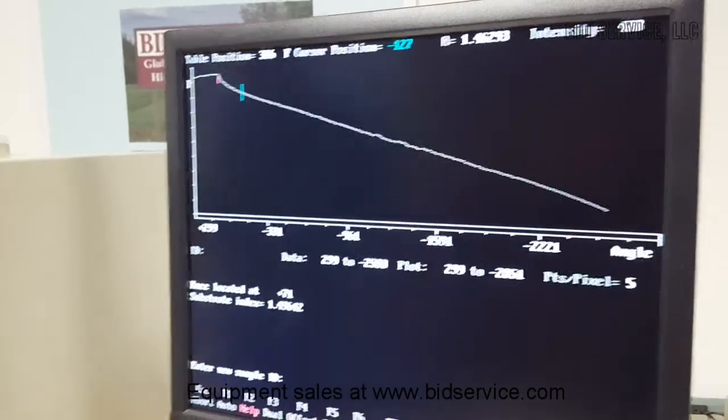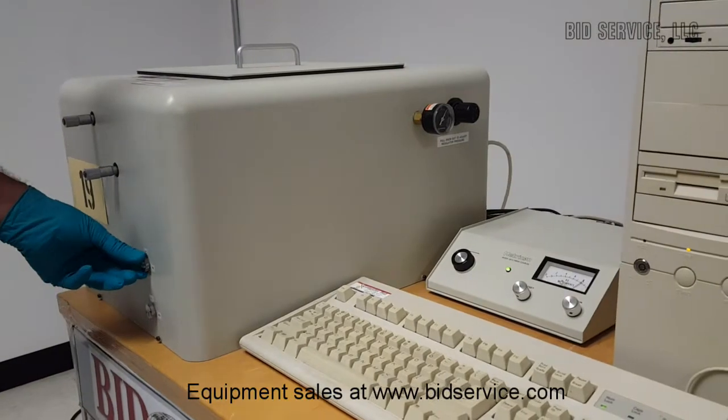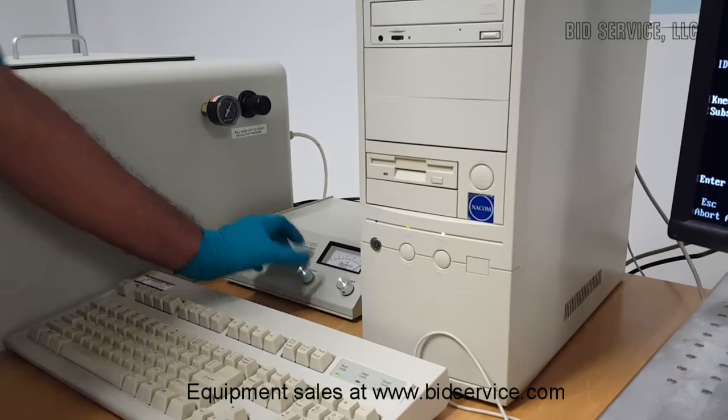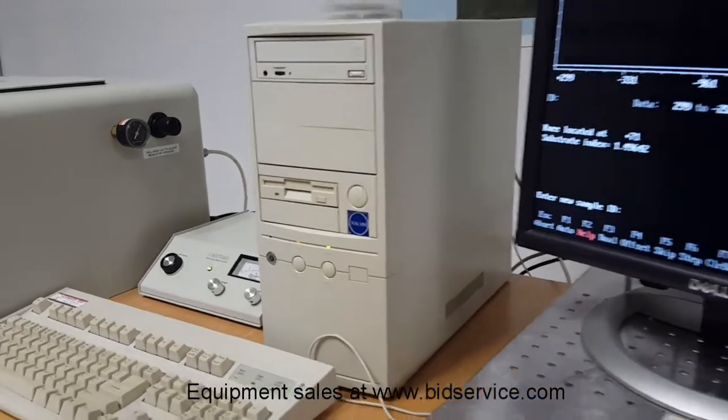So I'm going to switch it to the helium neon laser now, and since we changed the wavelength, now we have to again do the referencing.